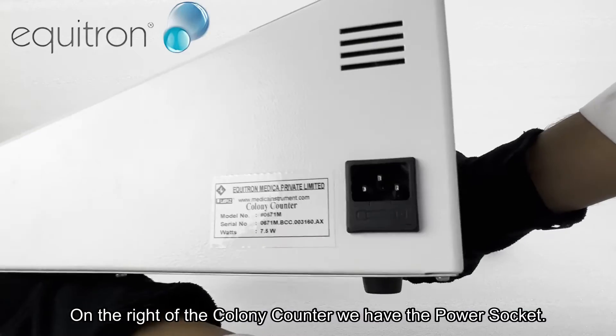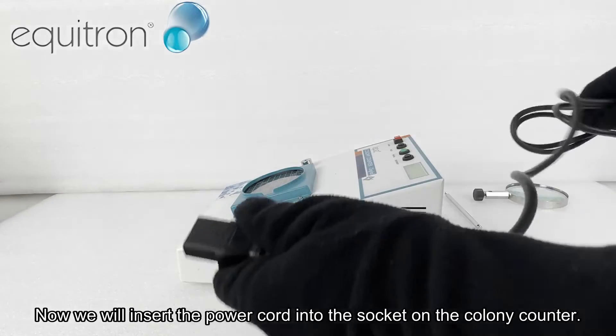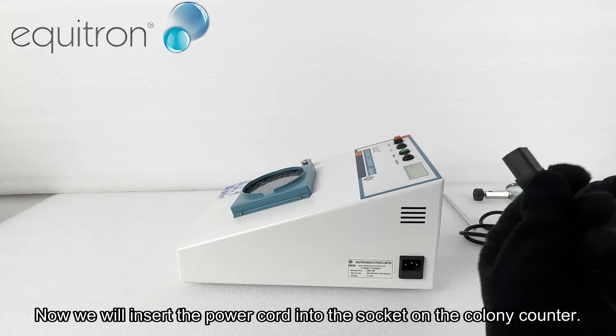We will insert the power cord into the socket on the colony counter. On the right of the colony counter we have the power socket. Now we will insert the power cord into the socket.